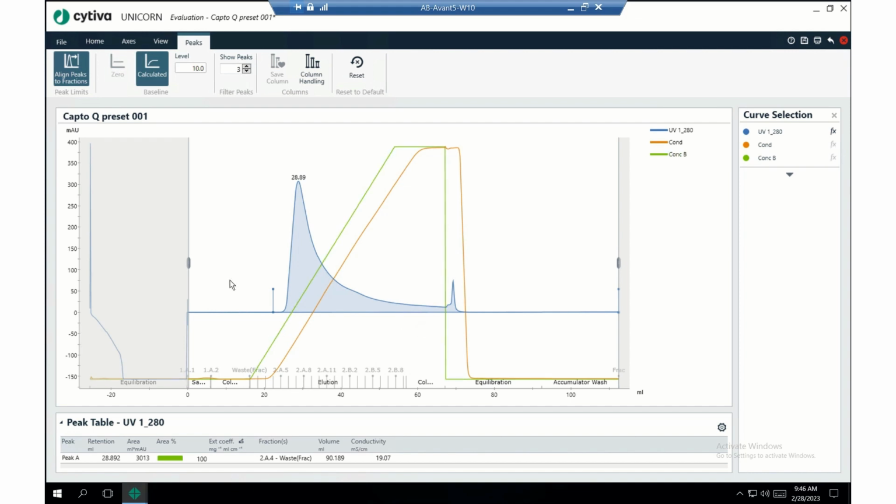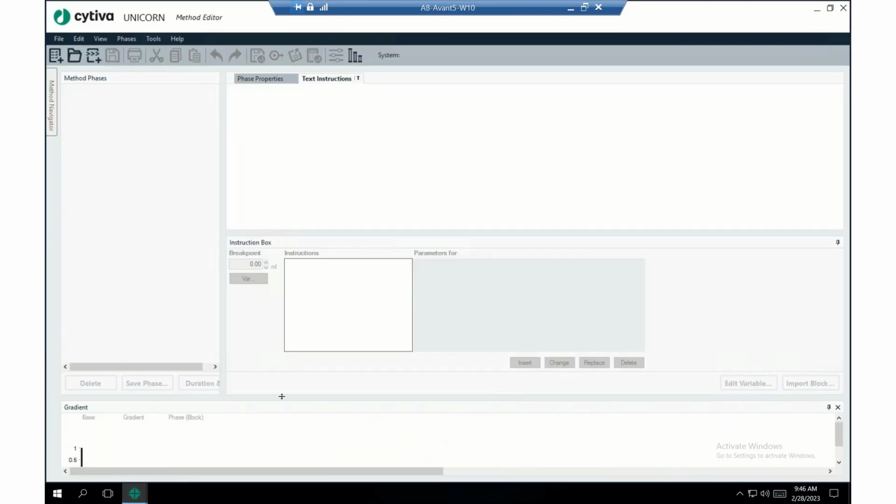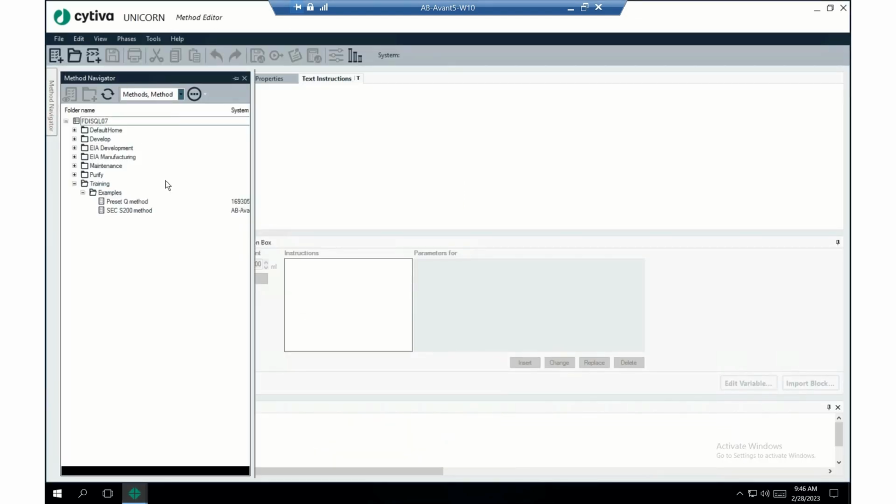So let's go to our preset method editor. We'll open up the method editor. Here's our preset Q method.